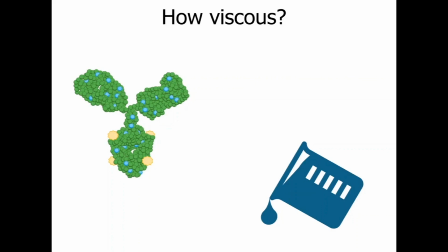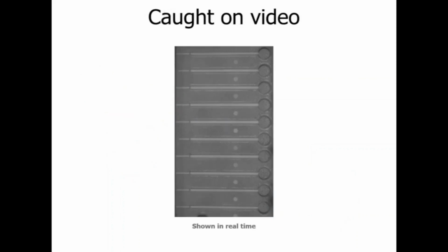You might look at the second virial coefficient, B22, but you can also use viscosity for that. Viscosity is also important for considerations of administration of the drug substance. Most viscometers are slow, need a lot of material, and also a lot of manual or researcher involvement. Here's how we measure viscosity. In this example, we're looking at water, a 2 centipoise viscosity standard, and a 10 centipoise standard. And then we repeat this twice more. So water, 2 centipoise, 10 centipoise, water, 2, 10, and then water again.